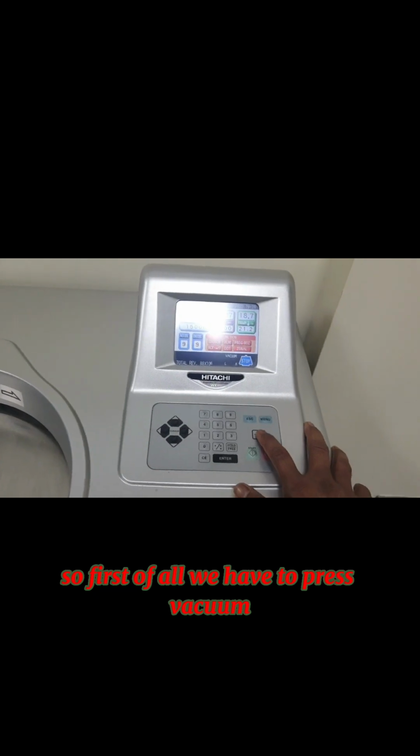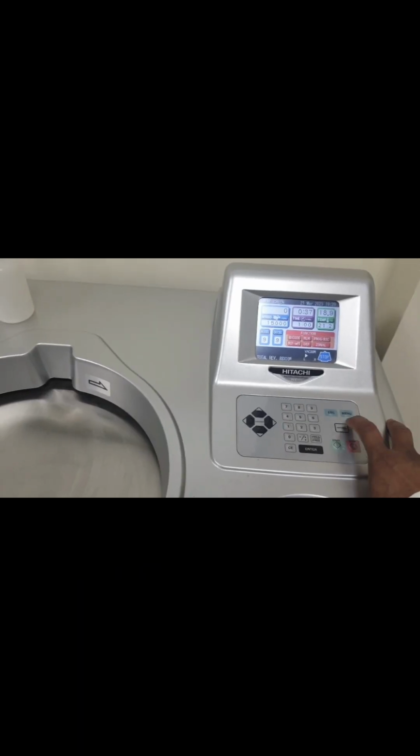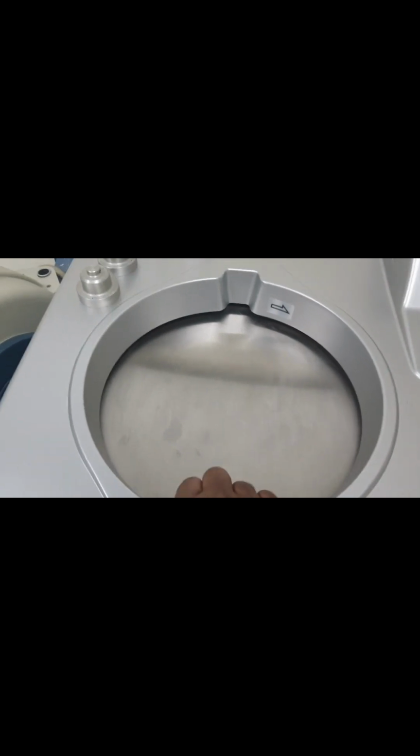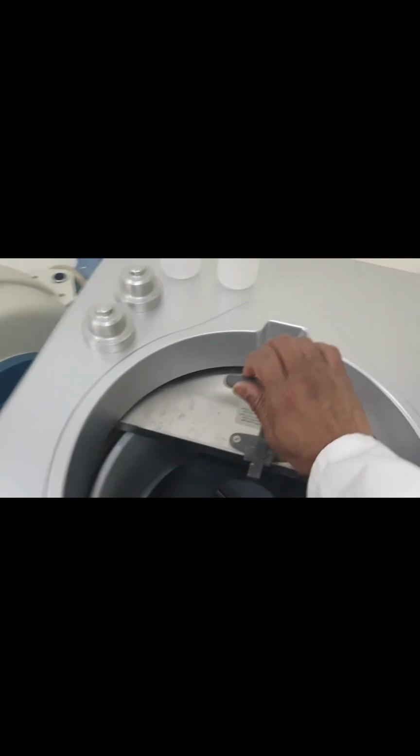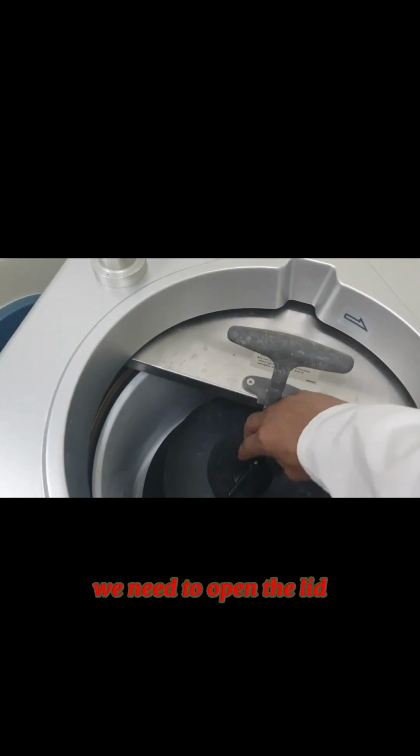First of all, we have to press vacuum. Now after pressing vacuum, we'll open it. So it's open now, and then you can see there is a lid. We need to open the lid.